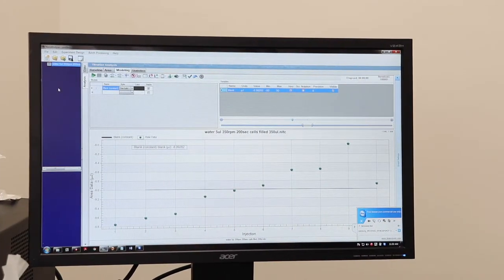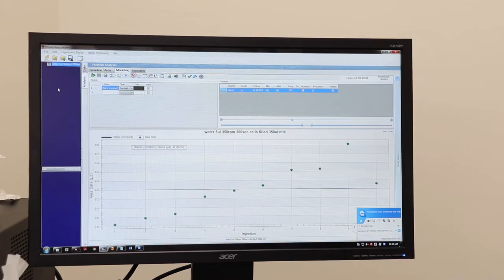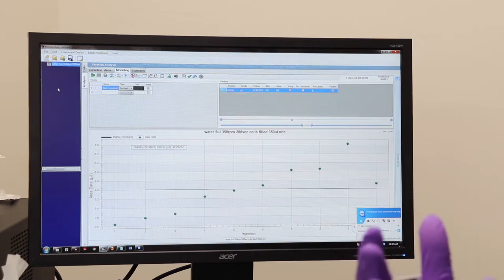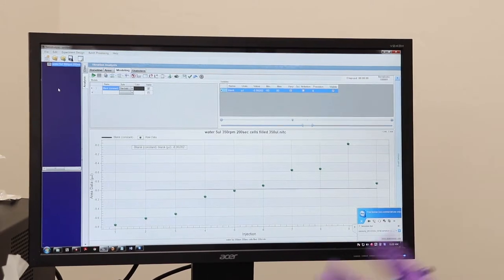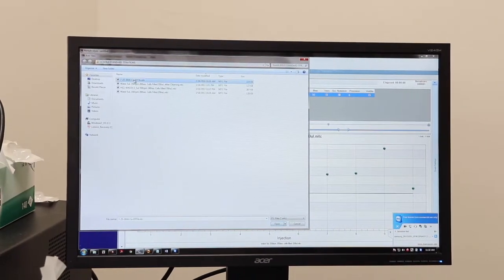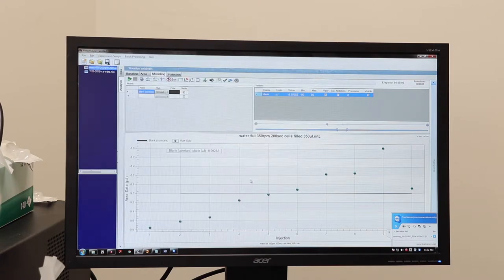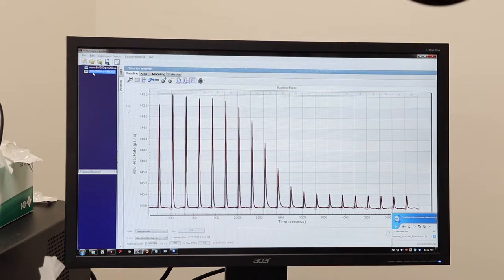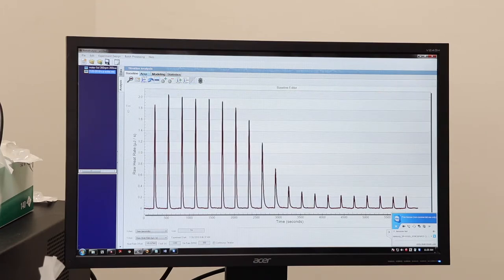Next, let's look at the experiment where we do calcium into EDTA. And this is what you'll want to do before you use it for your own experiment the first time. If you don't get the proper numbers doing that, then your own experimental outcome might be suspect. So we'll add another file to this. Here's a calcium EDTA experiment. This time you can see we have much greater heats on each injection and we see our titration as it comes down. Same sort of thing. It auto finds where the baseline is to begin with, with the individual points. That looks pretty good. So we will subtract the baseline. Again, we'll go to the area. And this is where we want to confirm the syringe concentration, cell concentration, initial volume, and the injection volume.